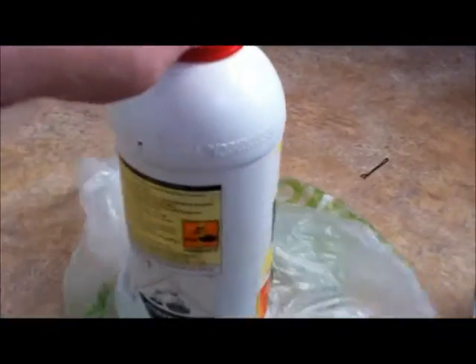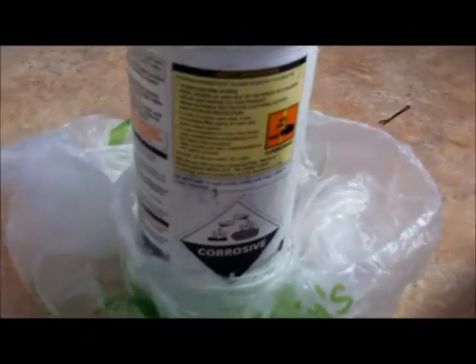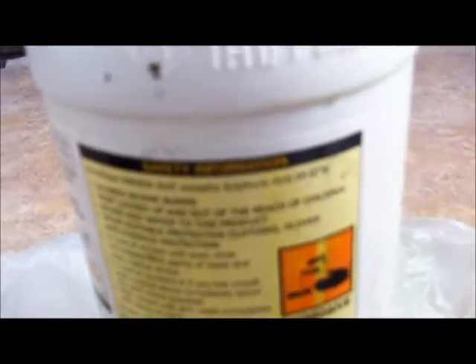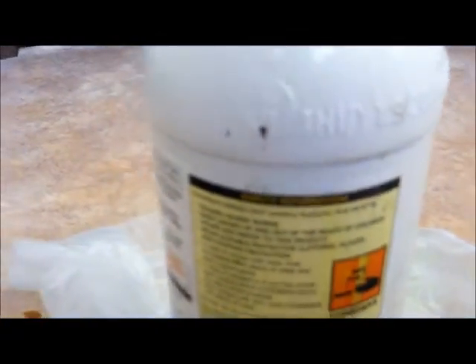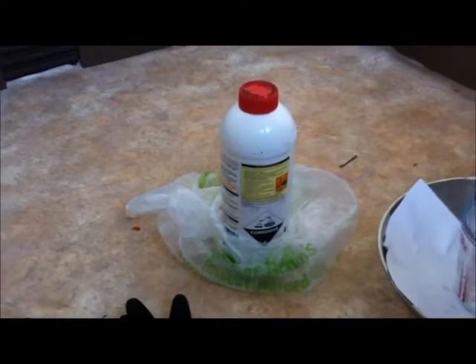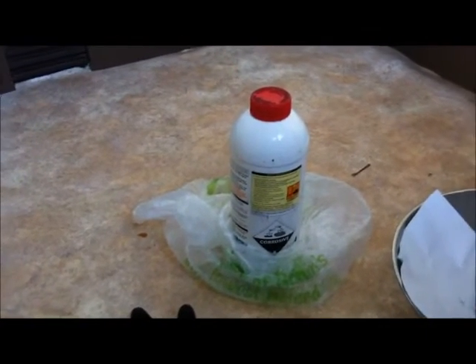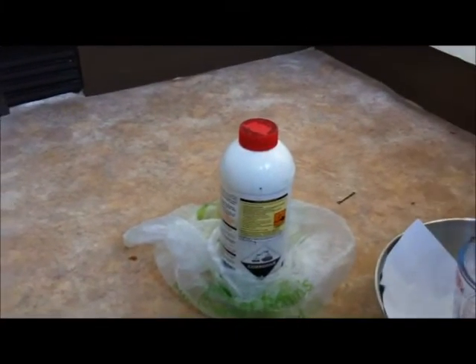If you have a look at the labelling, it does say 95 to 97% sulfuric acid. Now this stuff, when you pour it out, is quite black looking because it's obviously got other contaminants in it. It's not pure sulfuric acid, but for most purposes that doesn't really matter unless you're looking for a super pure product at the end of your experiment. Most amateur chemists probably aren't.